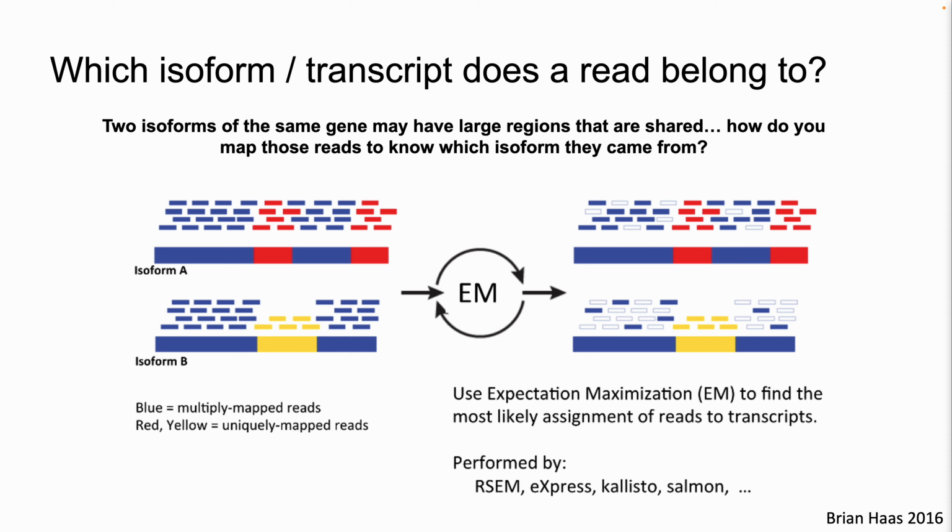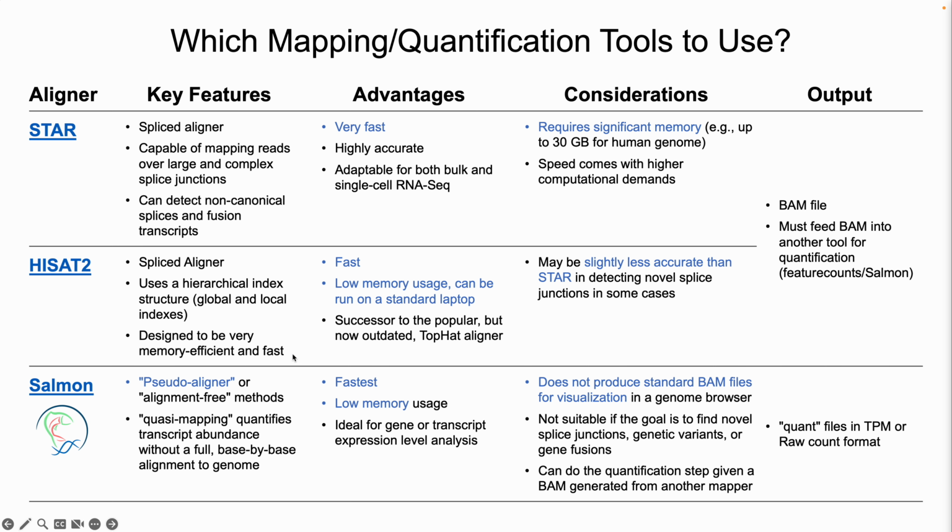It was something that tripped up early mappers a lot because, right, you might say no problem with that one, but the average expression level of isoform B you might infer to be lower than it should be. Or actually, I should say higher than it should be, because you've got all these duplicate mapped reads that didn't actually belong with that isoform. It took us a long time to figure out what was going on with that.